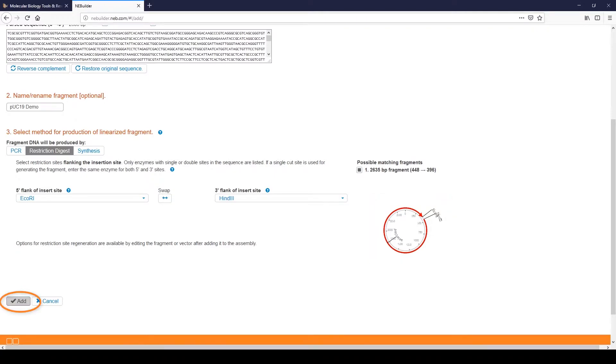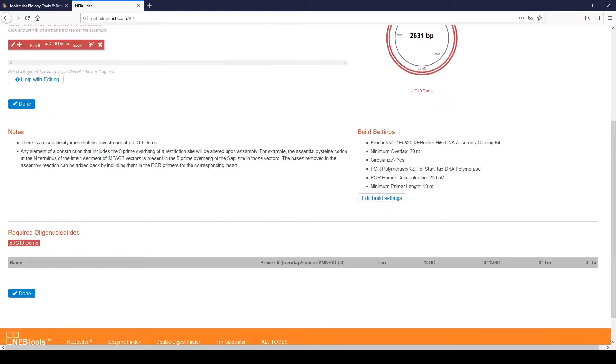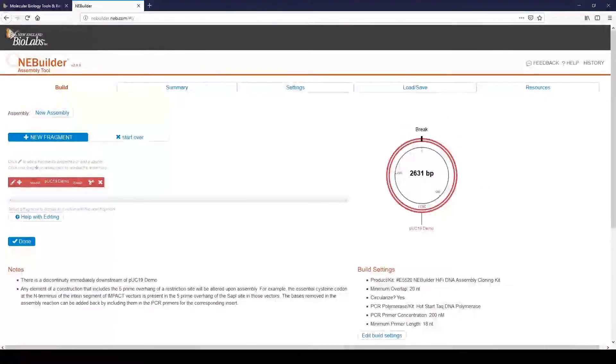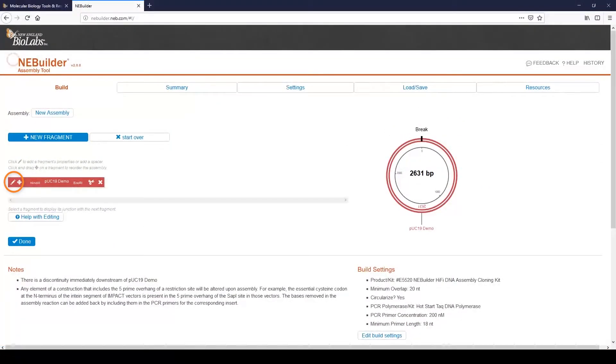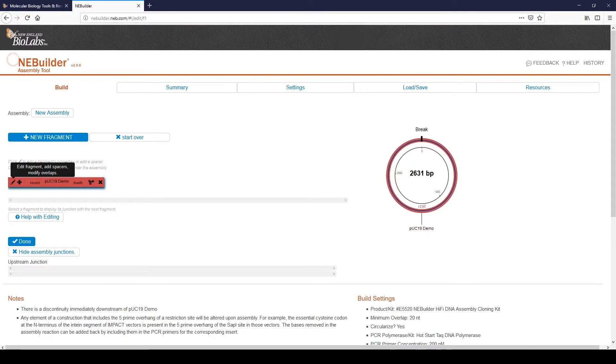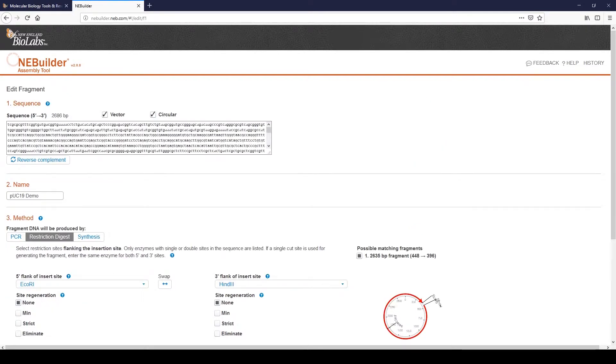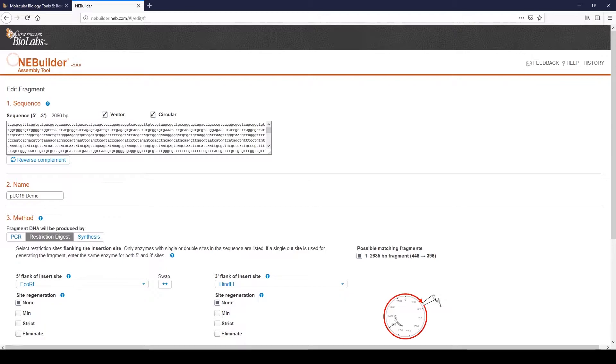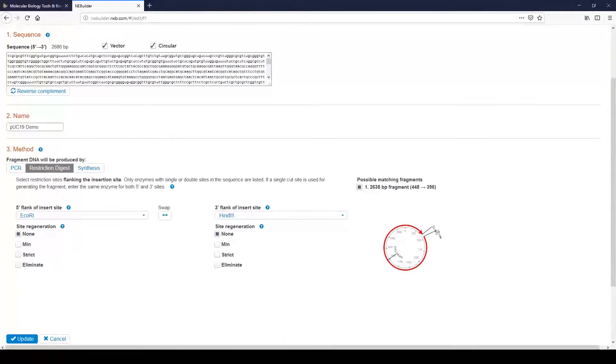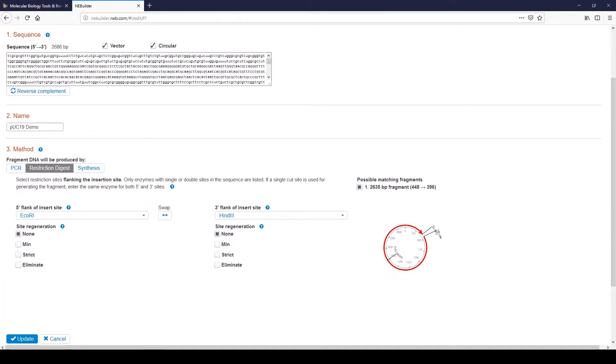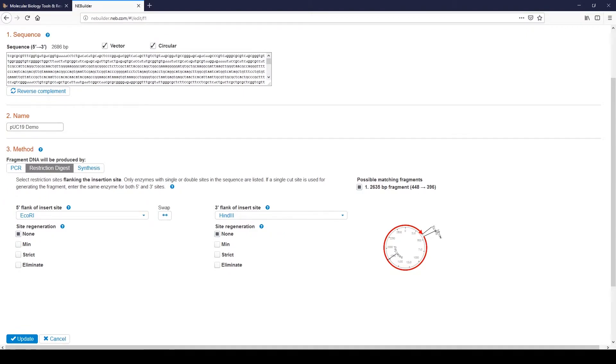On the next page, you can edit the fragment. Click the pencil icon to edit the fragment's properties or add a spacer. We will edit the fragment by regenerating the HINDI-3 site. Site regeneration adds bases to primers in order to rebuild the restriction enzyme recognition site. We are not using primers to generate this fragment, but the information will be used in the design of the primers for adjacent fragments. Go to the downstream 3' site and under Site Regeneration, choose Strict.